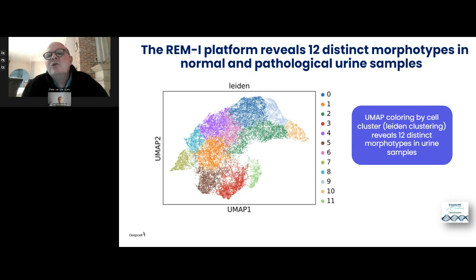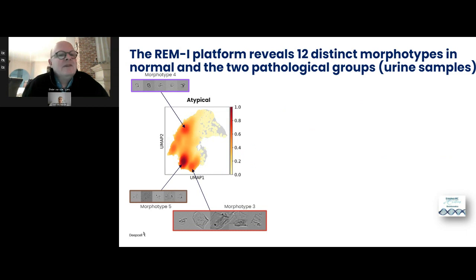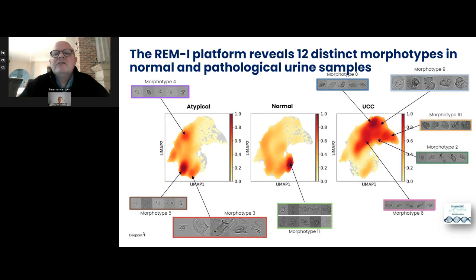Basically, I'm telling the students, you see a bird here. And if you look very carefully, the bird has on the right side a beak, a yellow beak. Now, look very carefully. After studying the three groups, we obtained every time the bird, and we are projecting on top of the bird the different cell shapes.